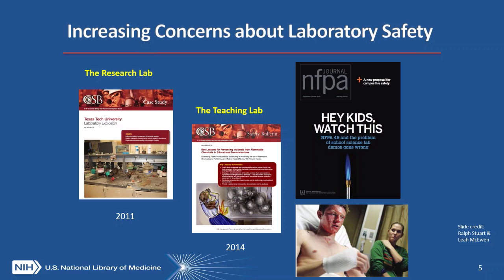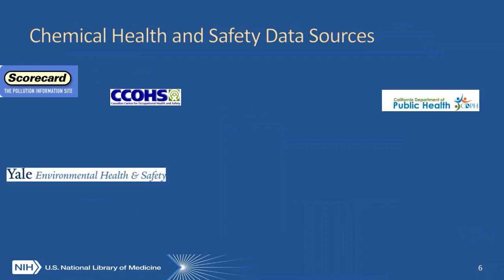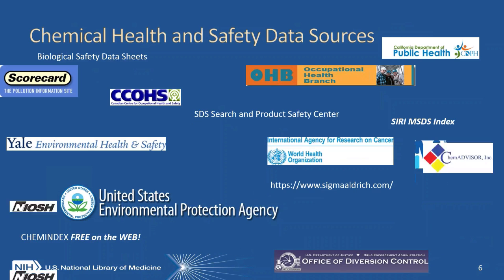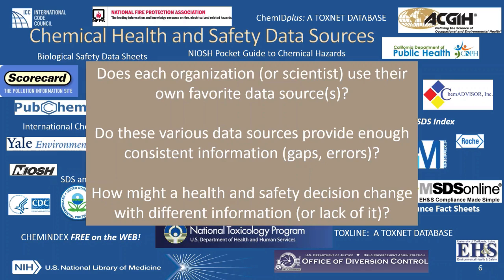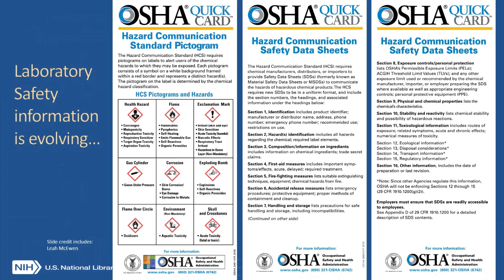This has been specifically addressed in reports by the ACS and National Research Council. Chemical health and safety data sources are blessed in many ways by having so many different data sources available. However, this presents an issue in that there can be gaps or errors in information. Every scientist may not be aware of the various sources of information. Coupled with this, laboratory chemical safety information is evolving. There has been a recent transition from material safety data sheets — the so-called MSDS — to the global harmonization system GHS safety data sheets, otherwise known as SDS.